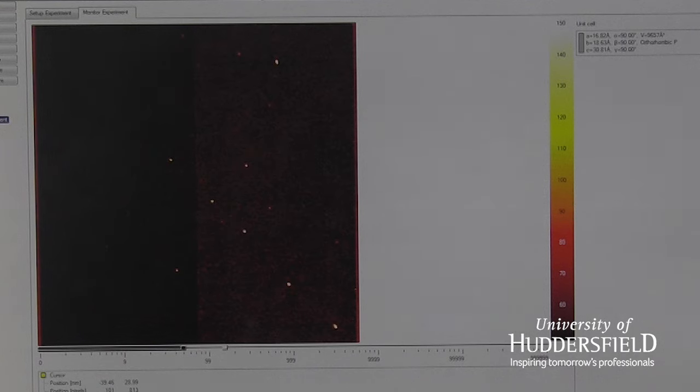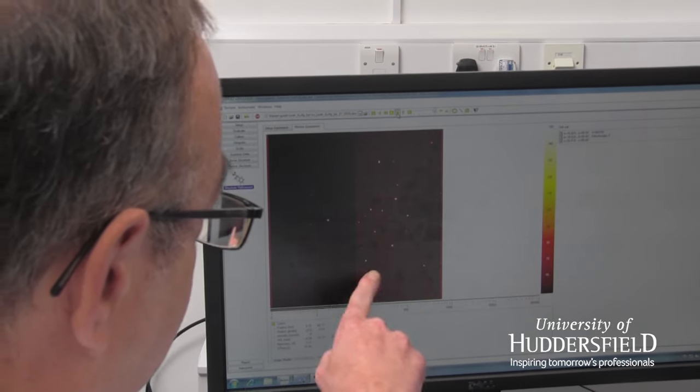We have to collect masses of data. But once we've done that, then we can find out what has made these spots.